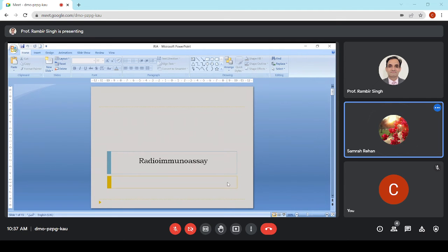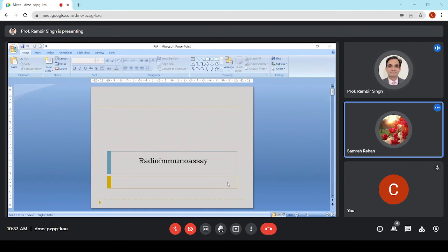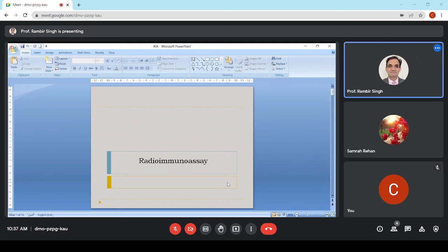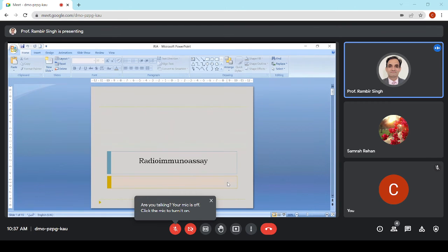The concentration of the colored compound produced should be in micromolar concentration, right?